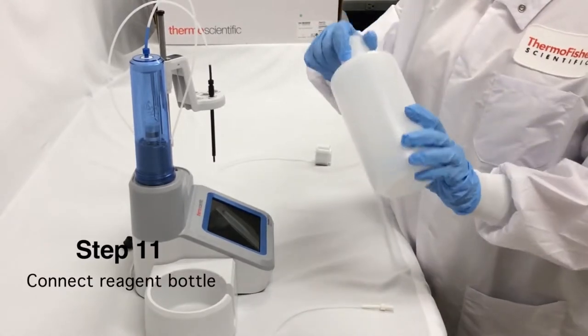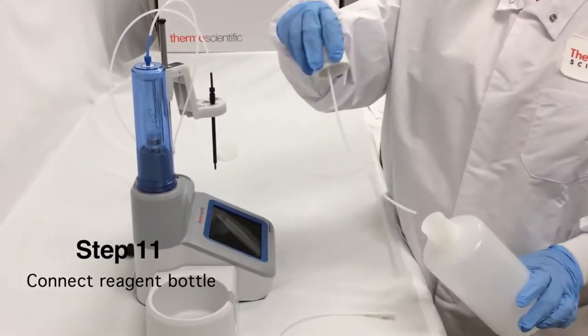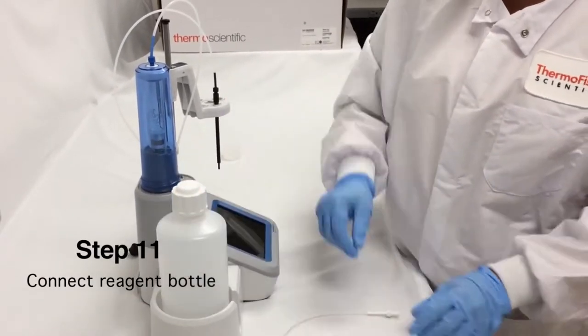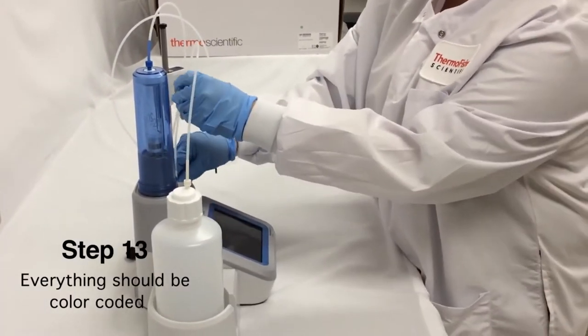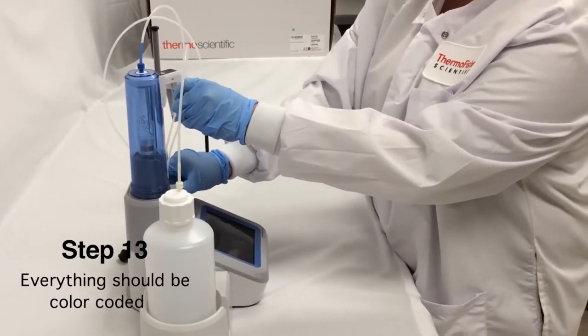Next, I'm going to take my reagent bottle, and then I'm going to take my white tubing.